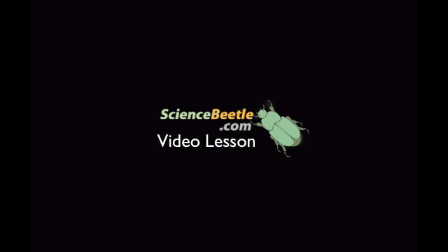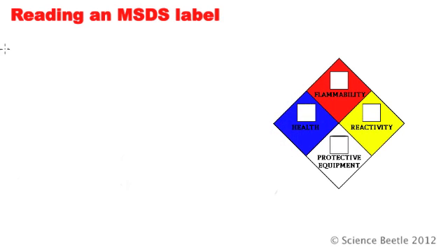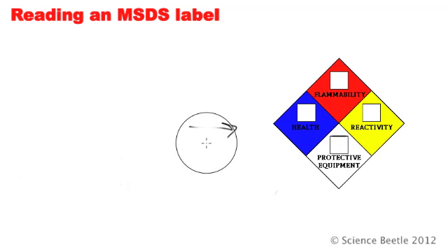Science Beetle. Welcome back students. What I wanted to do for this lesson is go over reading an MSDS label. MSDS labels provide us with a lot of information about the safety that you should know about prior to using any chemicals in the lab. Right here on the side, what I provided for you is going to be an example of an MSDS label. But before we go there, I want to make sure I explain what MSDS is.